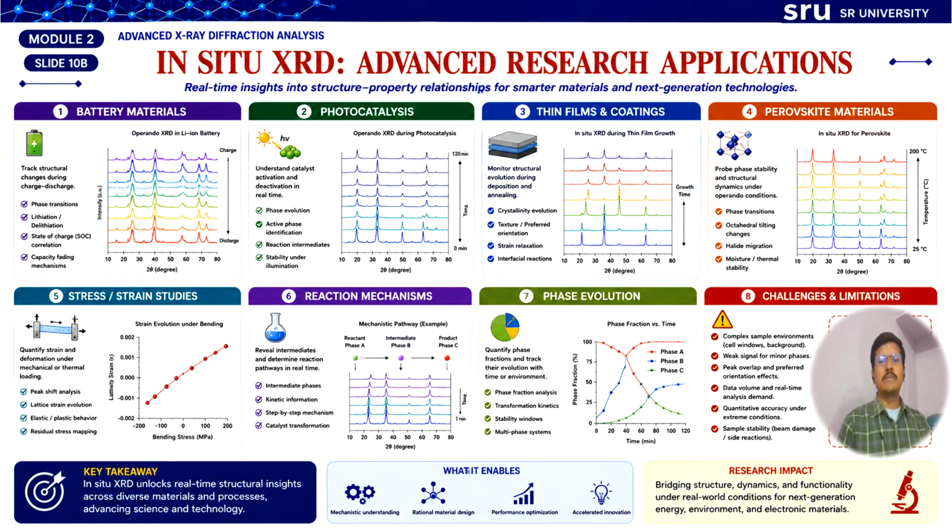The key takeaway here is that in situ XRD provides real-time insights into the materials evolution. It enables advanced research in energy materials, catalysis, thin films, optoelectronics, and nanotechnology.